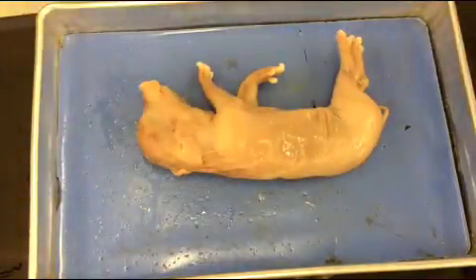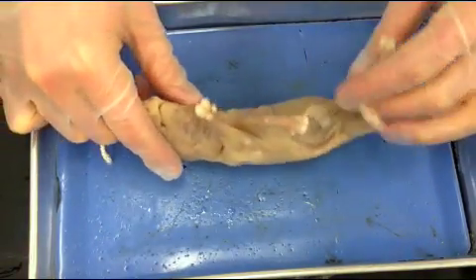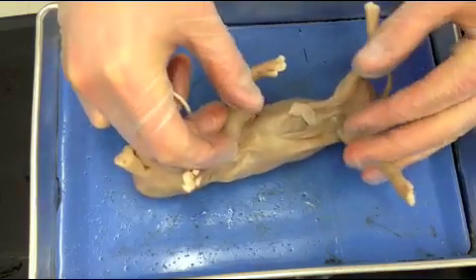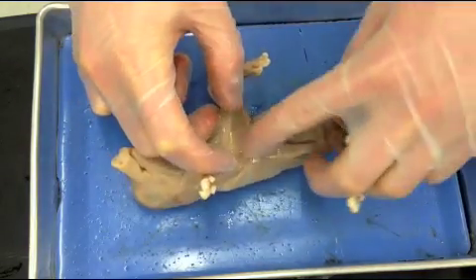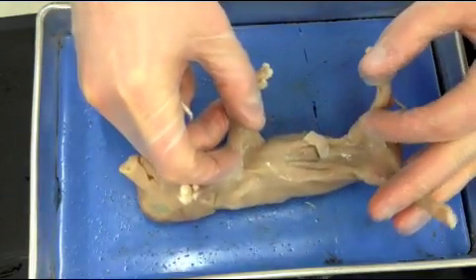Today we're going to be dissecting the fetal pig. The first thing we have to do is put it into our dissecting tray in a position that exposes the underbelly, or the abdominal and the thoracic cavity, so we can take a look at the internal organs.